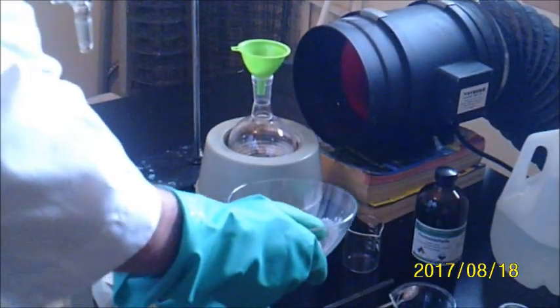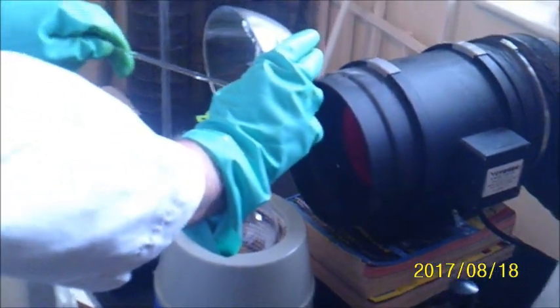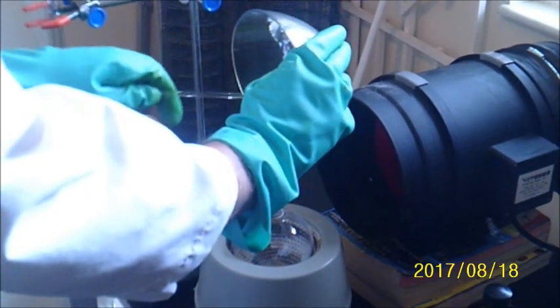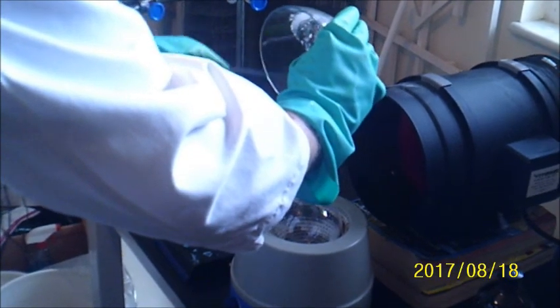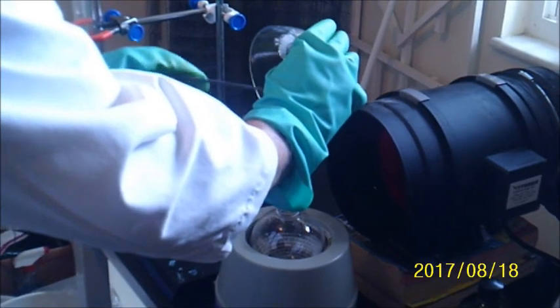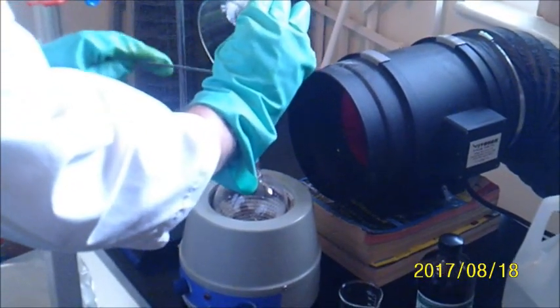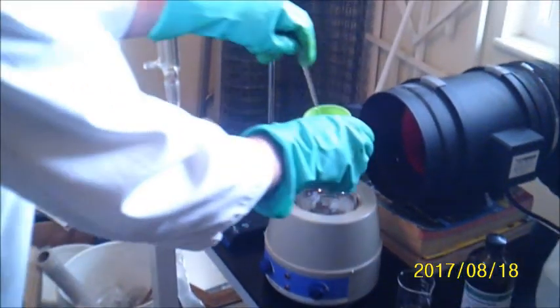The first step is to add the sodium carbonate to the round bottom flask. I have a blower fan in the back, which is used to vent any formaldehyde fumes which might come off after heating the formaldehyde solution.